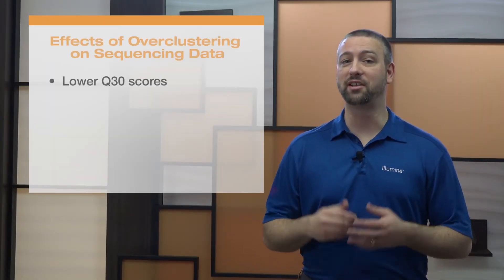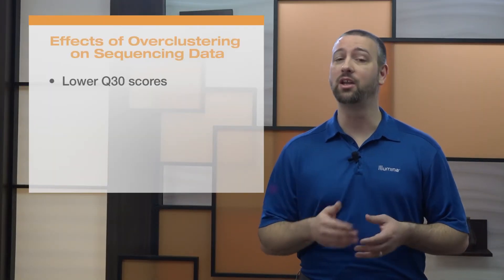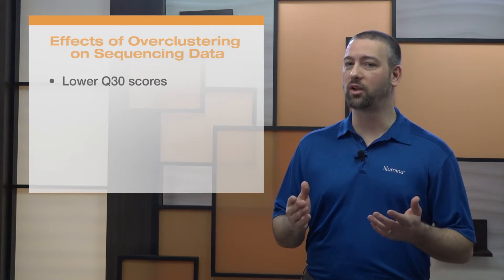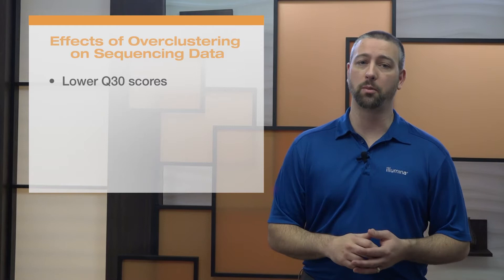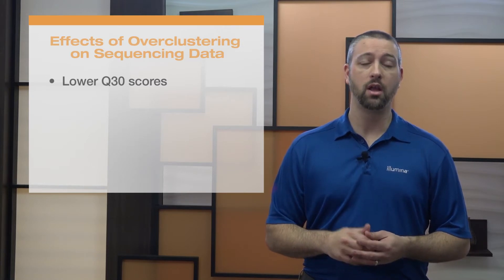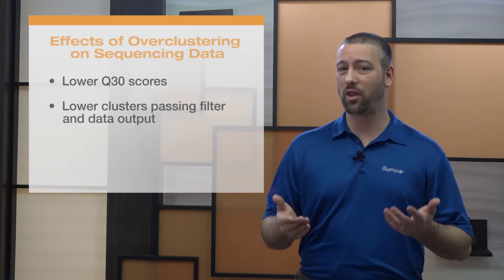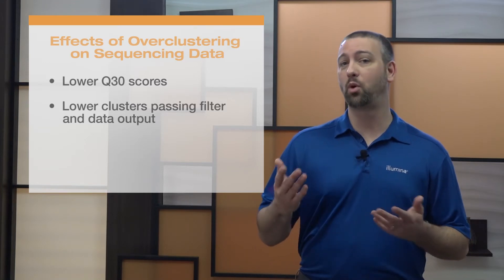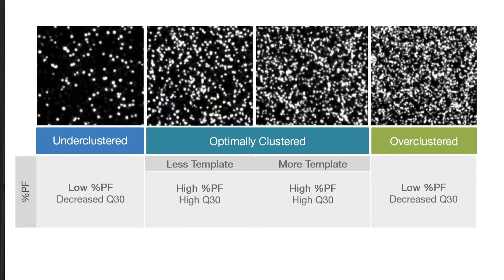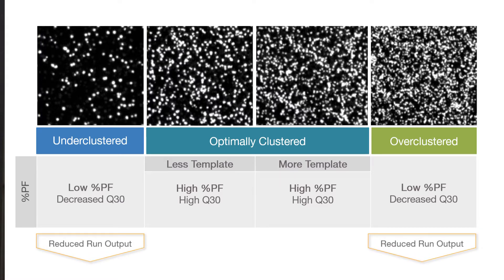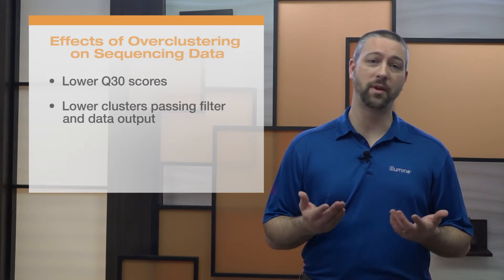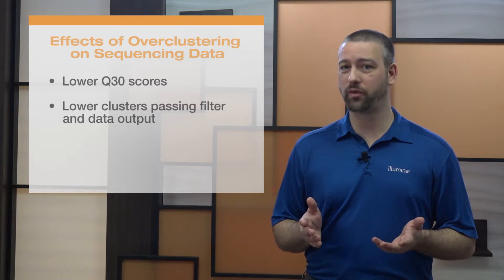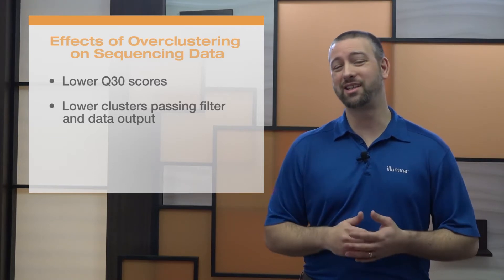First, overloaded signal intensities decrease the ratio of base intensity to background. This creates ambiguity during base calling and decreases data quality, leading to lower percent greater than Q30. Next, over clustered flow cells typically have more overlapping clusters, which leads to poor signal purity from each cluster and thus poor template generation. This decreases the percent of clusters passing filter, or percent PF, ultimately reducing run output. Also, index reads typically have lower diversity, which can cause poor base calling. Since over clustering worsens the potential for poor base calling, this can lead to demultiplexing failure.